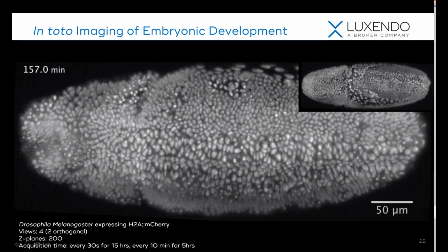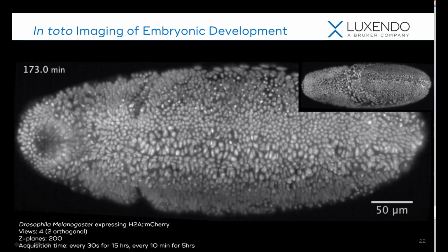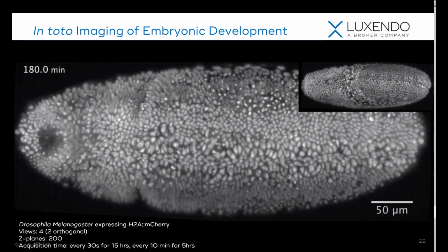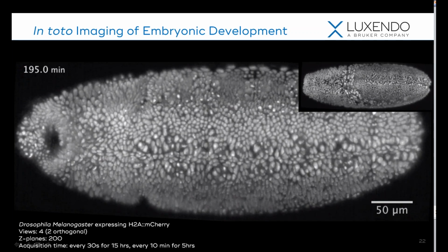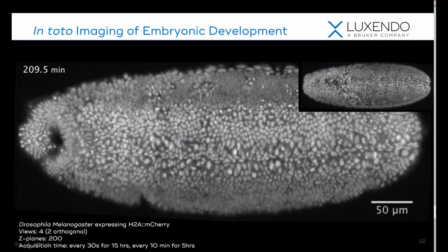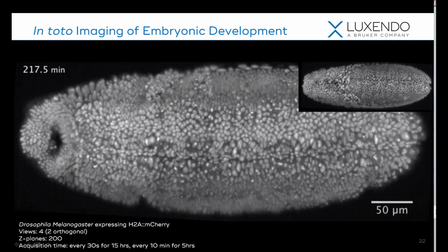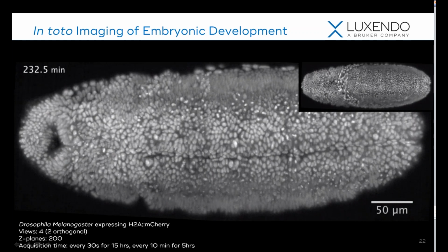This is extremely advantageous for developmental biologists, because instead of seeing this development happening at static time points, we're watching this as a very dynamic process happening in real time before our eyes and developing on the same time scale as its brothers and sisters would in vitro that were not in the microscope.